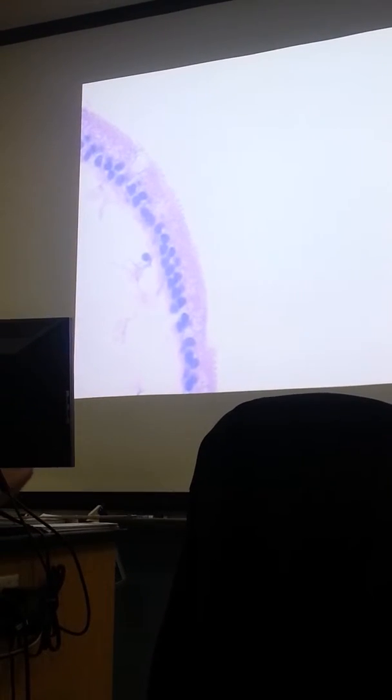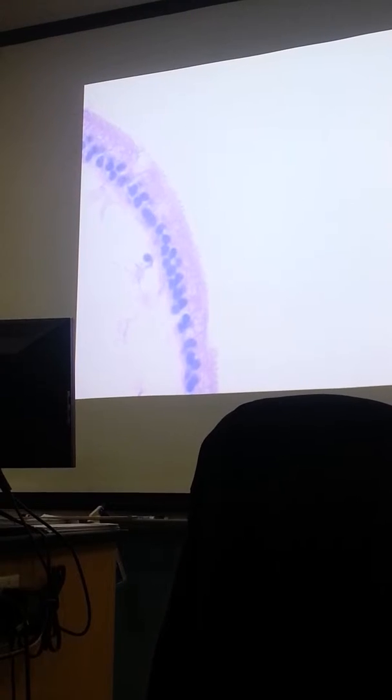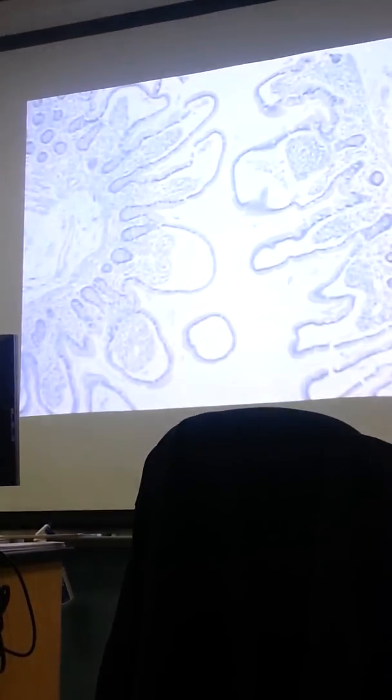Your individual cells, you can't see their cell walls, but you can see that they're mostly columnar shaped, right? Here's a goblet cell. Here's our microvilli. Microvilli increase surface area just like villi do. Let's pop way back out to where we started. Too bright now, so we got to take off the dimmer. And then refocus. And that's where we were.